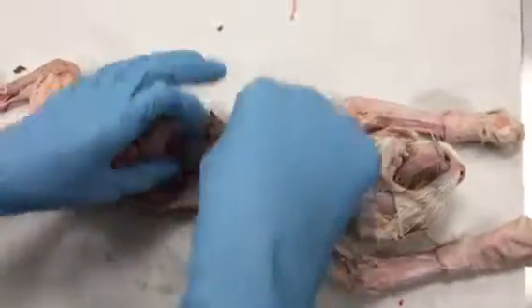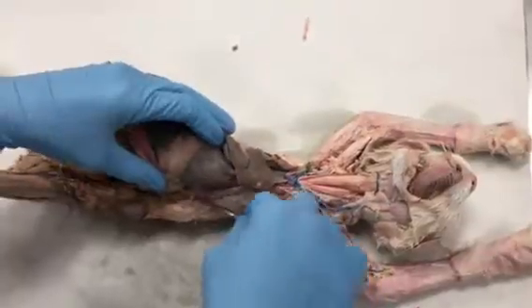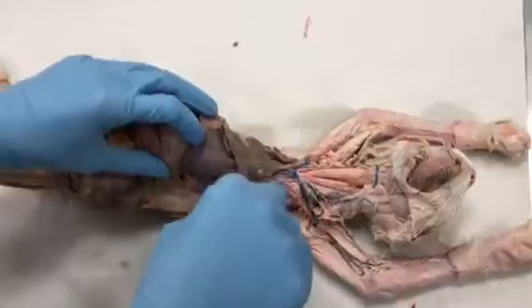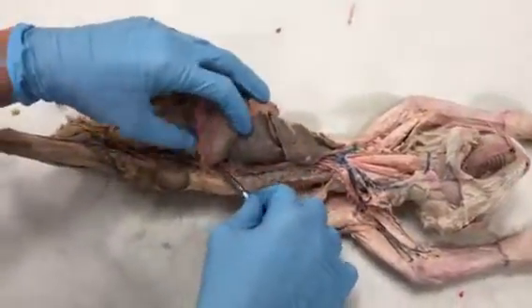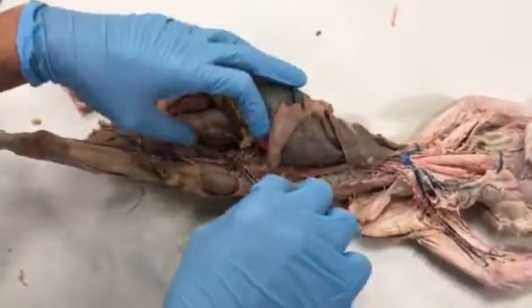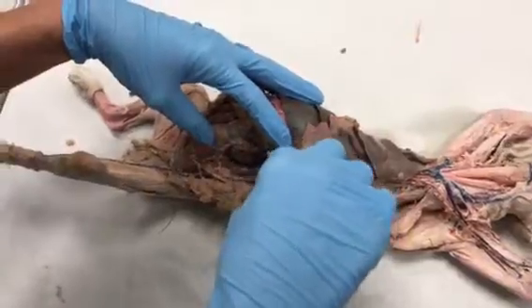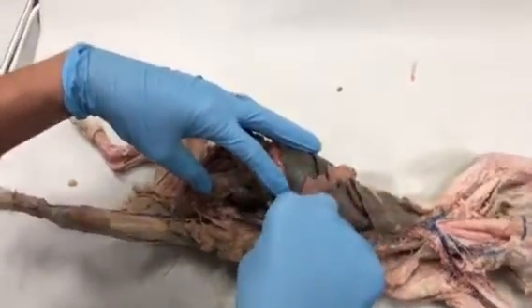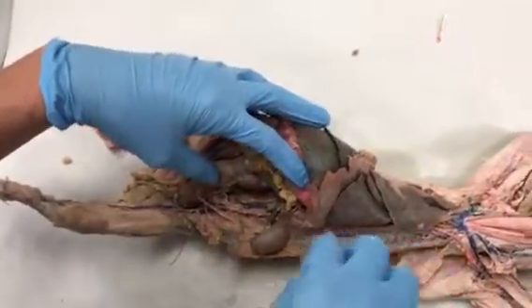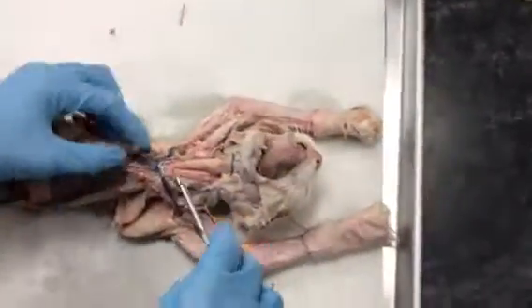Then it turns and descends and becomes the descending aorta, and while it is in the thoracic cavity, it is the descending thoracic aorta. It will then poke through this aortic hiatus, which is a hole in the diaphragm, and it will continue on as the descending abdominal aorta. And, well, here it is right here. It just continues on down. And we will see it as we go through our different arteries that branch off of it.